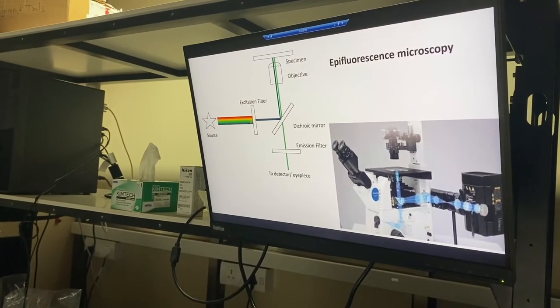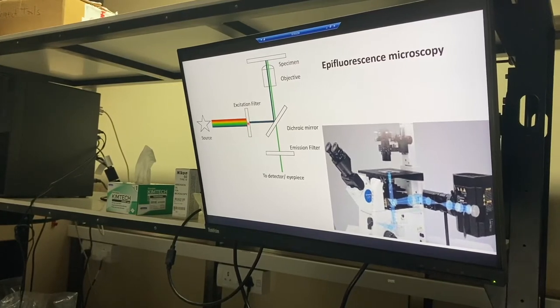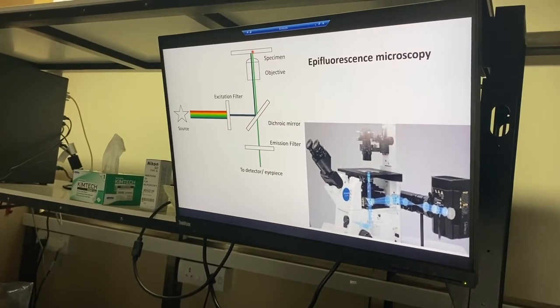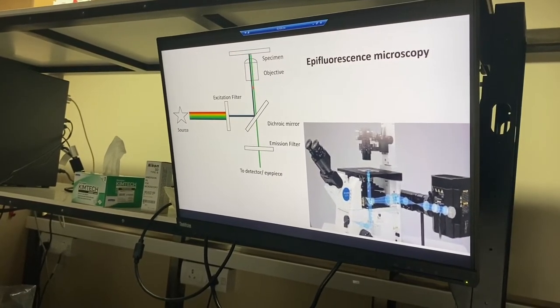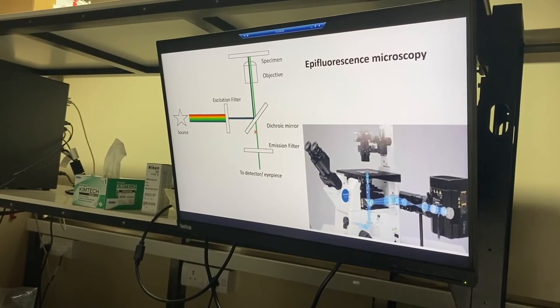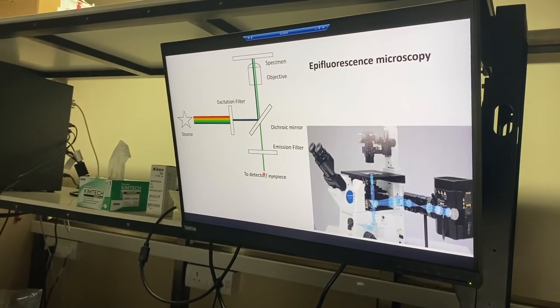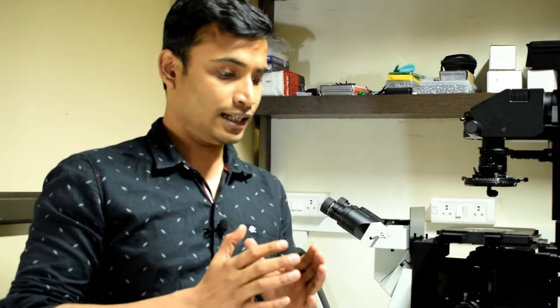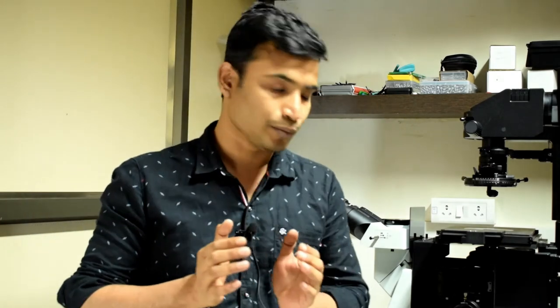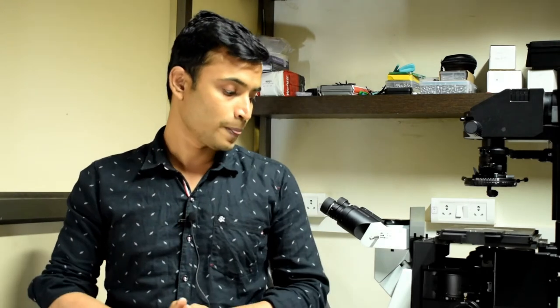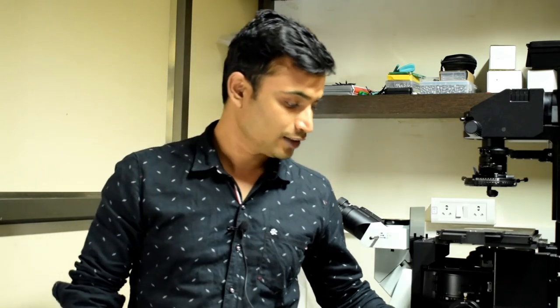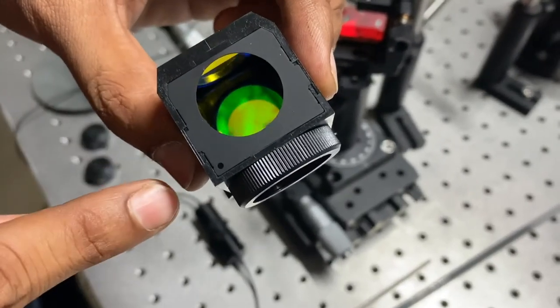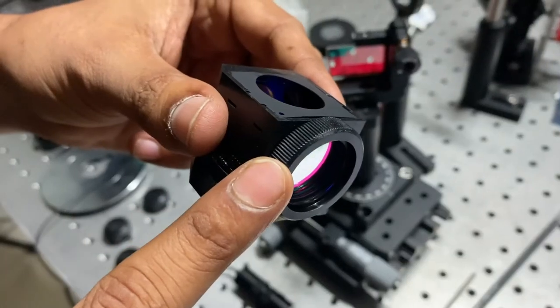In fluorescent microscopy, white light passes through an excitation filter, is reflected by a dichroic mirror towards the specimen, and the specimen emits fluorescent green light, which is transmitted through the dichroic mirror and an emission filter to the detector. The excitation filter, dichroic mirror, and emission filter are combined in a component called a fluorescent filter cube. Here is one — you can see the dichroic mirror, emission filter, and excitation filter.